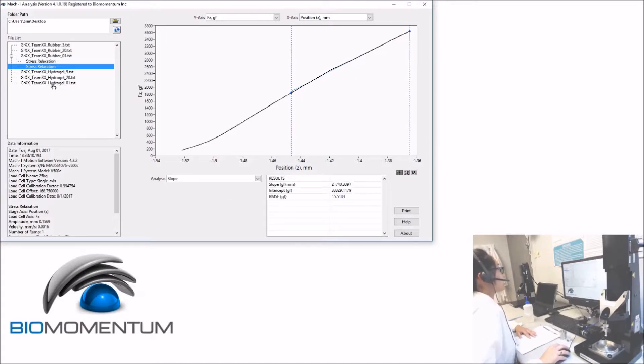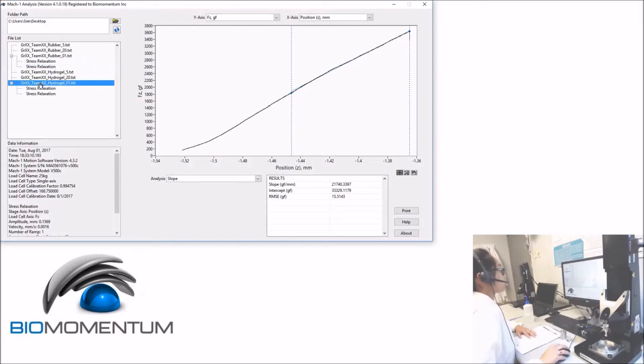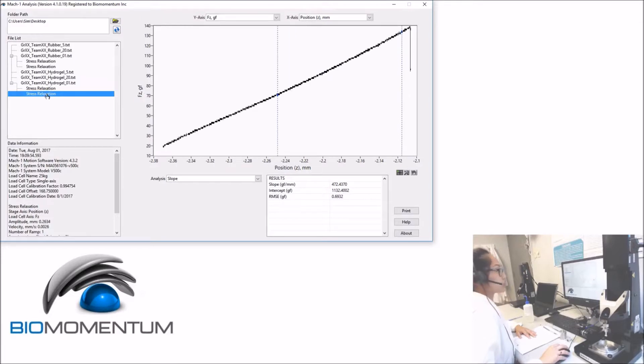Now let's see the hydrogel samples. Select the first result file from the hydrogel disk and the second stress relaxation.